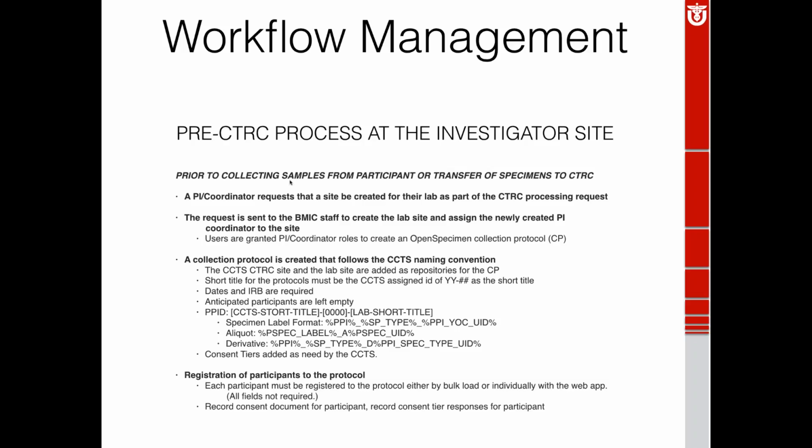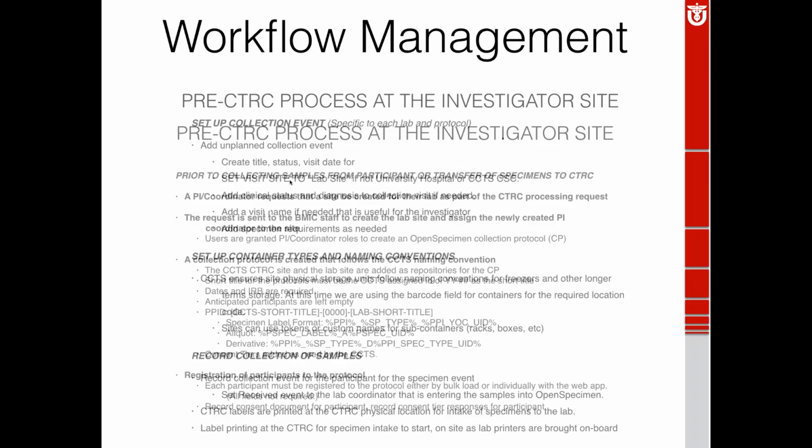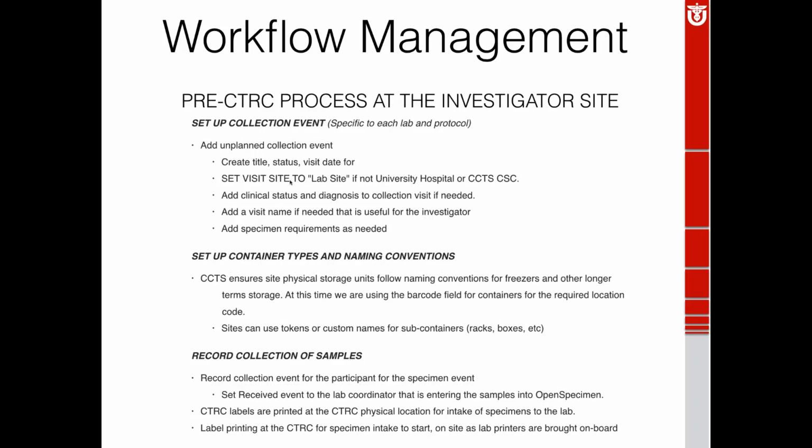Once that happens, all the participants are registered. We can either do that with bulk load. Consent documents are either recorded in OpenSpecimen or in REDCap, so linkage with REDCap will make that easier as well. And then there's a few more pre-CTRC processes that need to take place. One is the collection events, the container types and the naming conventions, and then the collections of the samples. So there's all this stuff that sort of has to be set up.